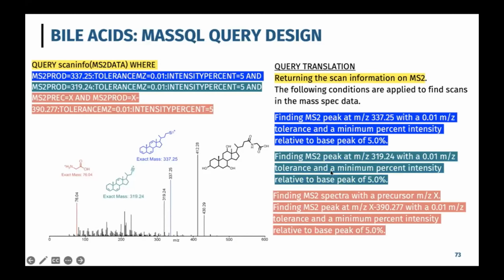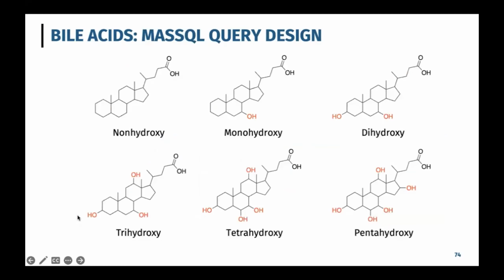it. The other thing that we did is that, let's say, okay, we do see these two ions. Now we have precursor masses. We know we're looking for trihydroxylated bile acids, so we can subtract the mass of this trihydroxylated bile acid to see what the delta mass is. And if we find that, we can report on it. So we built these queries for monohydroxylated, dihydroxylated, trihydroxylated, tetrahydroxylated, and pentahydroxylated bile acids. The most common ones that people know about are dihydroxylated, trihydroxylated, but clearly tetrahydroxylated and pentahydroxylated exist as well.